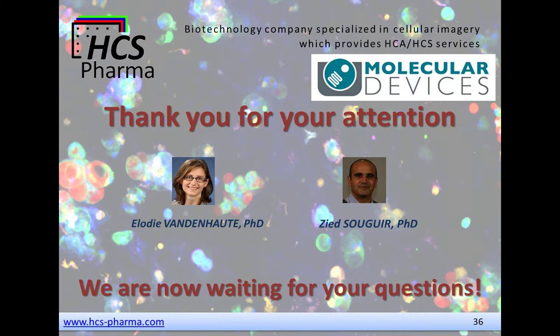I was not exactly sure what is being asked, but how many cell images can you capture per 3D 384-well plate?